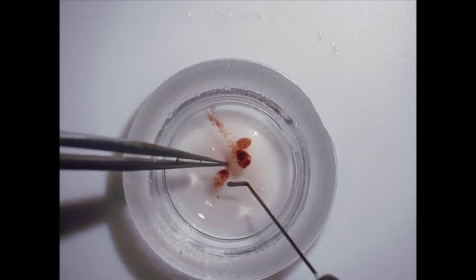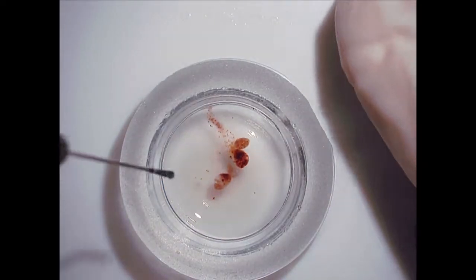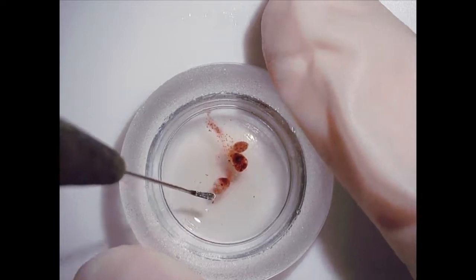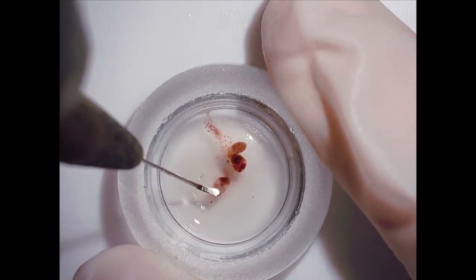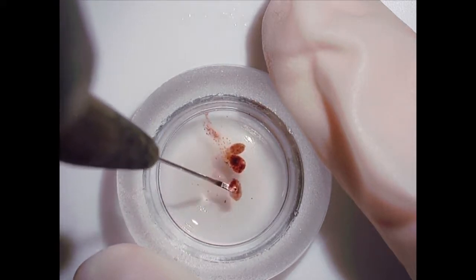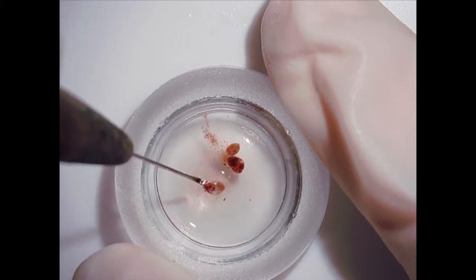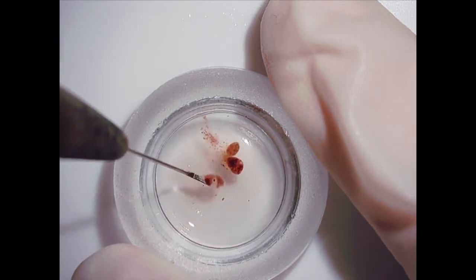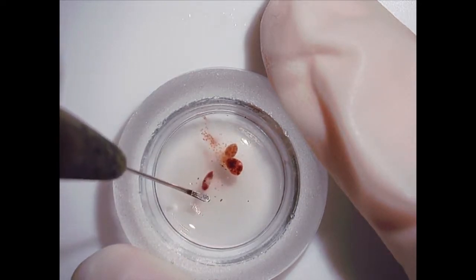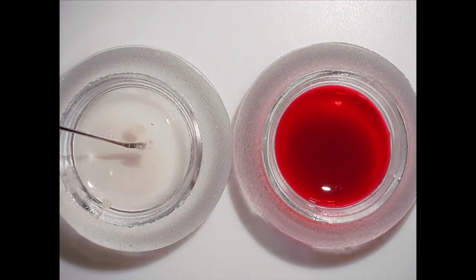You'll notice that the specimen is starting to clear. Again, press a little bit on the specimen. Use that surface tension to your advantage by lifting it up. You'll now move the specimens back to the hot plate or let them cold soak. Here we are, after they've been on the hot plate or they've cold soaked, you'll see they're almost ghost-like.